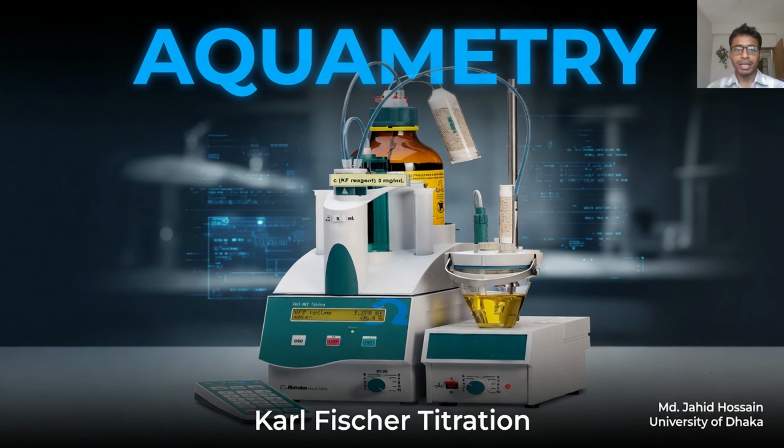Good morning everyone. In today's video lecture, we'll learn about aquametry under the course of pharmaceutical analysis. So we'll check the different methods for water determination using different aquametric methods like Karl Fischer titration or azeotropic method or different thermogravimetric analysis. So let's start.